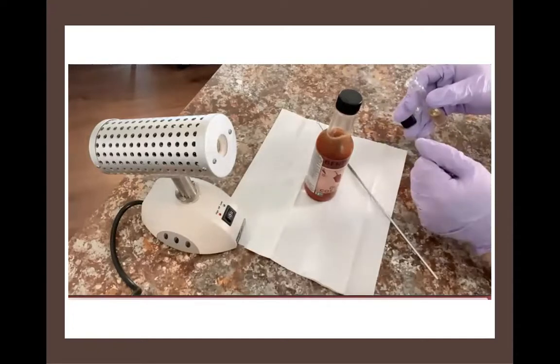Let's take a look at that again. Remember, the bottle of hot sauce is my Bunsen burner, and we're pretending there's a flame coming out of that black cap. So I'm going to take the neck, the open part, the mouth, if you will, of that test tube, and I'm simply going to pass it through the flame.